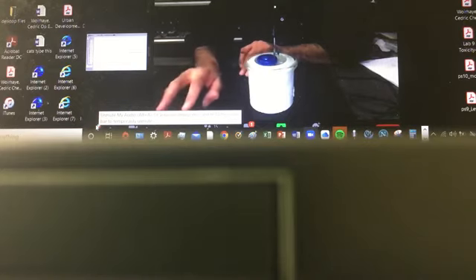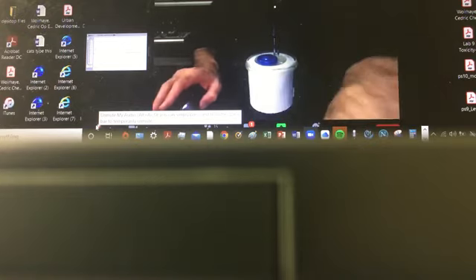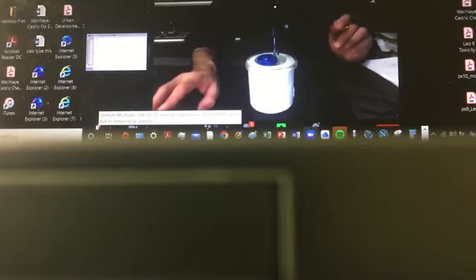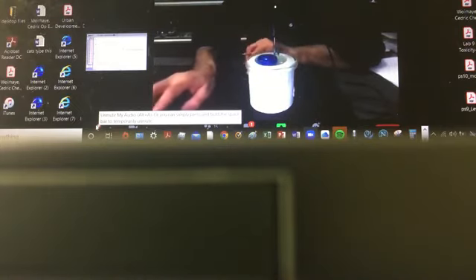So let me reassign that value. So I've just done some enhancement, just cosmetic.